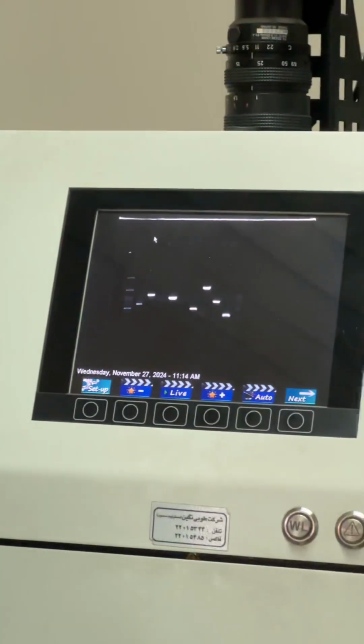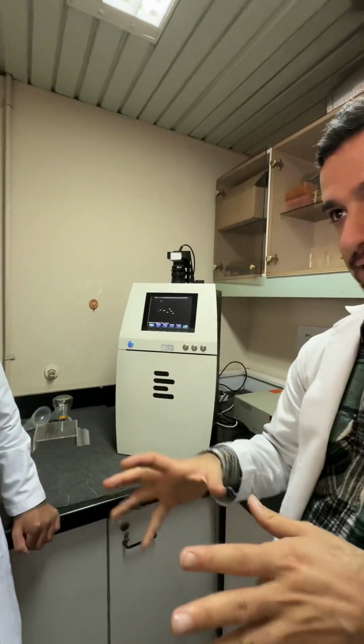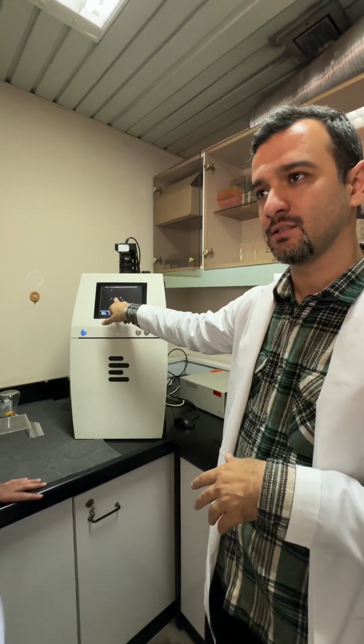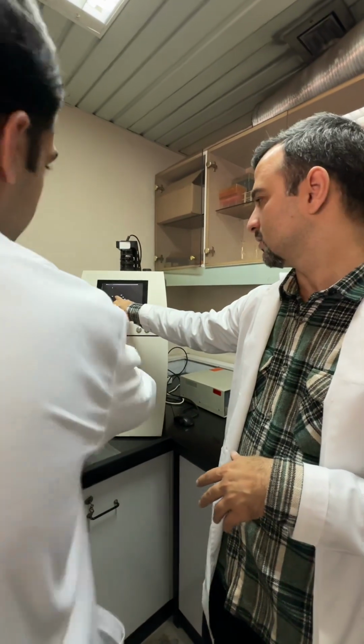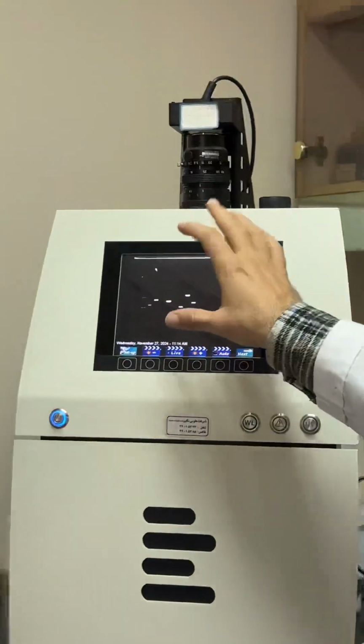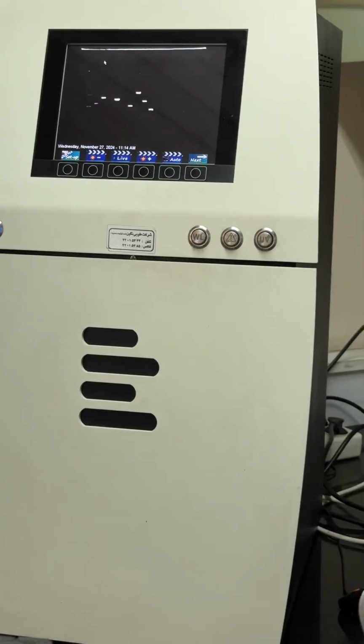He will say again. So for example, this is your final exam, and I will ask you, what does this band mean? That's the result of amplification. Very good. You understand? Very good. You please.